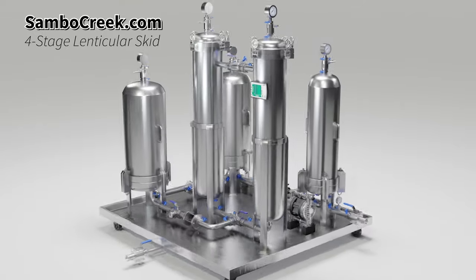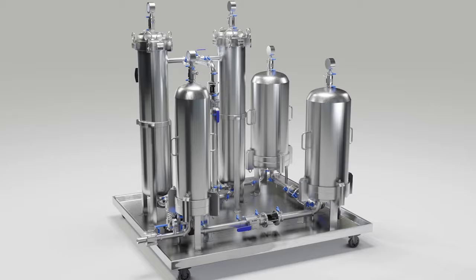Introducing the Sambo Creek CanisKid. This turnkey system is designed to filter solvent streams from a centrifuge.